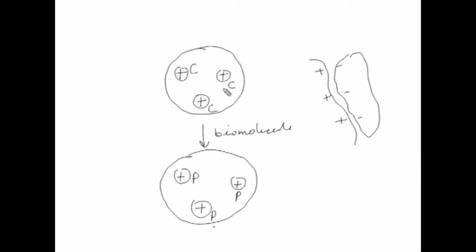You have to elute your protein, or take out your protein from the matrix, to separate different analytes in a mixture, and this will be done based on the affinities. Here you will put an eluent, a high ionic strength eluent, which will replace the protein with those ionic species in the mobile phase. Depending on this, as you increase the concentration of eluent or ionic strength, say you can add NaCl, and as you increase the concentration of NaCl, depending on the affinities of proteins, they will be replaced. So, if a protein has higher affinity, then you need a higher concentration of NaCl.